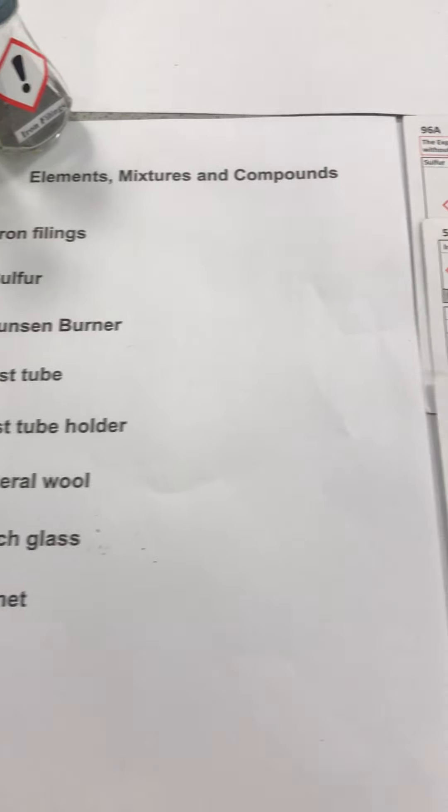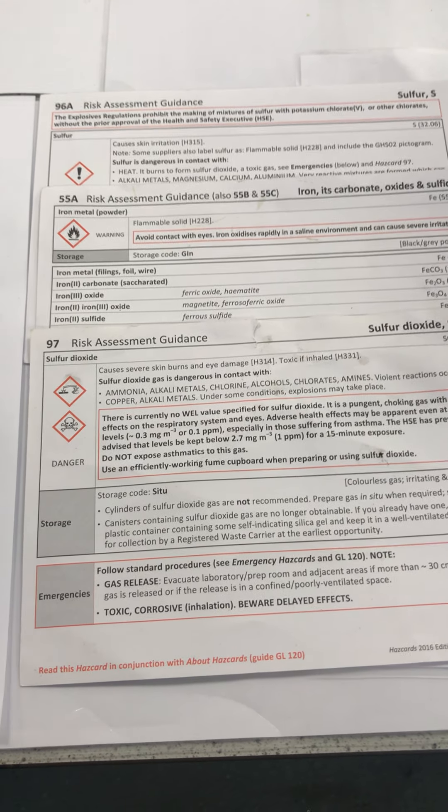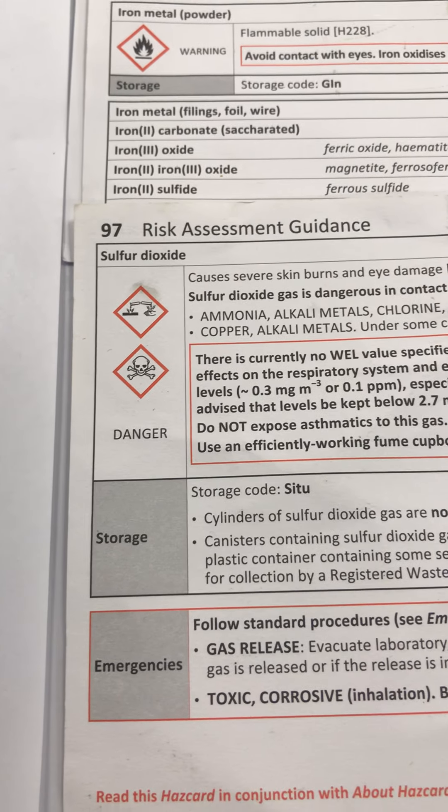Before we start the experiment we should do our risk assessment by looking at the Hazcards of these two elements. Once the risk assessment is done we have realized a gas called sulfur dioxide will be released in this experiment, so we prepare our equipment accordingly and make sure all windows in the lab are open.